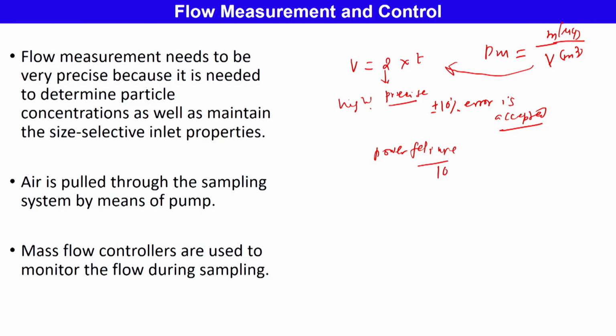You said that I started at 6 AM in the morning, and there was a power failure for about, say, 2 hours, and you stopped your measurement at 14 hours. In principle, I have collected my sample for 6, 8 hours, but actually for 2 hours there was no electricity, and Indian or low cost PM samplers don't record these kind of things, that the sampler was off.